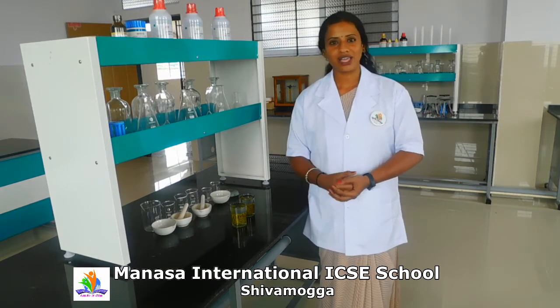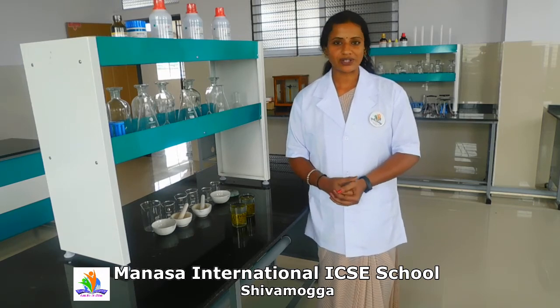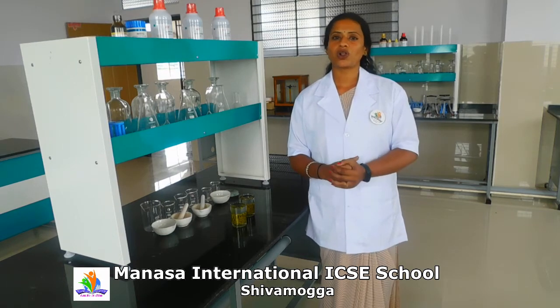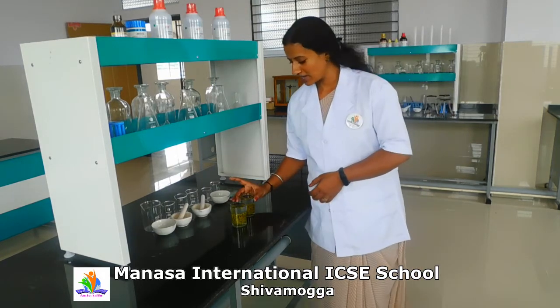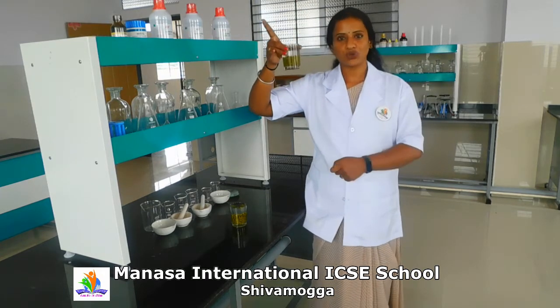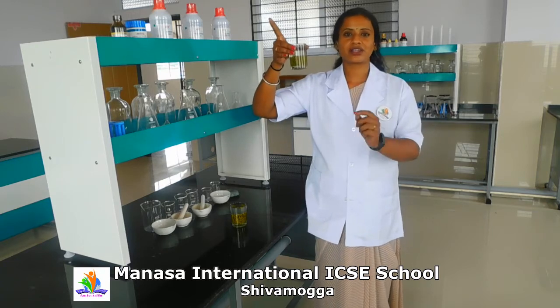So here we are in the chemical laboratory of Manasa International School. This is the most interesting and exciting chapter. You need to know what a chemical lab is and what its equipments are. First let's start with an activity here. I have taken a glass filled with water, and I have taken some grains, that is green gram.